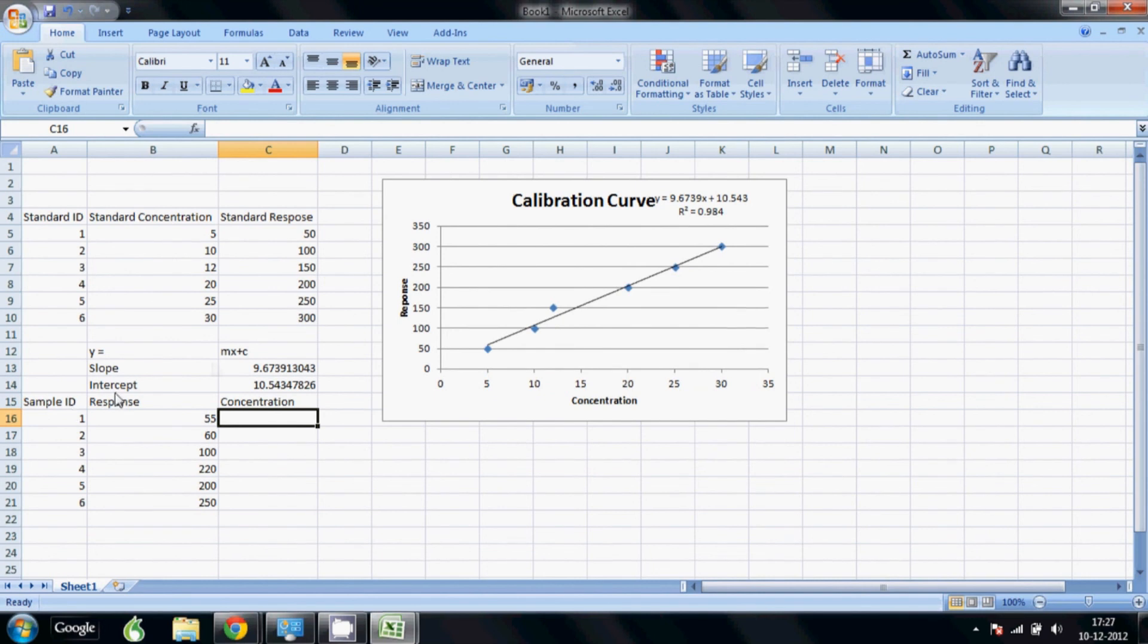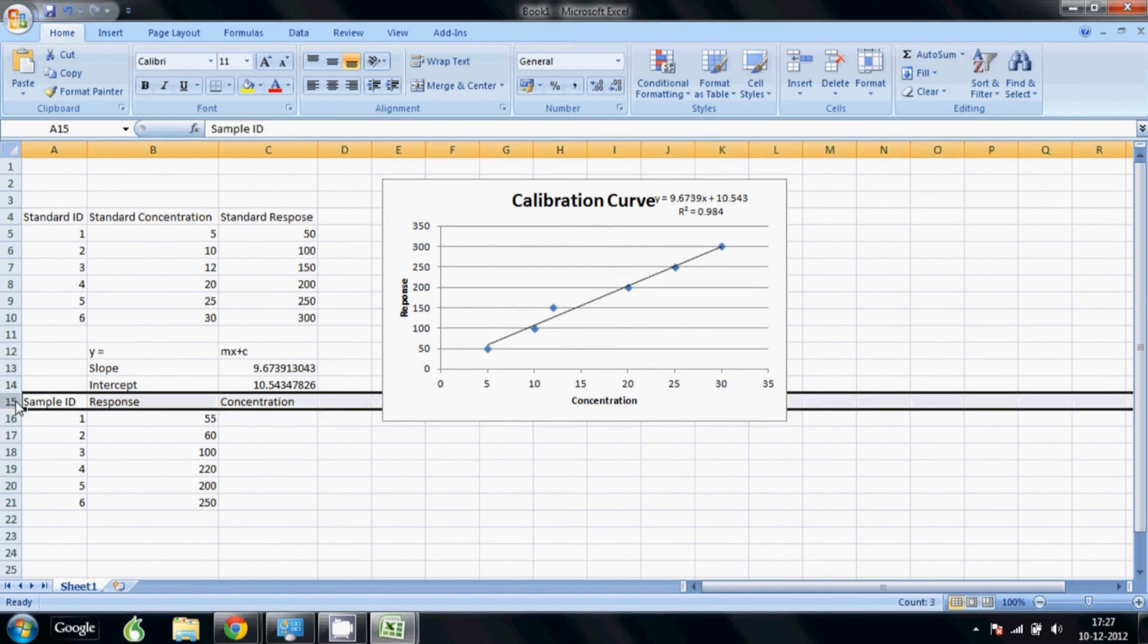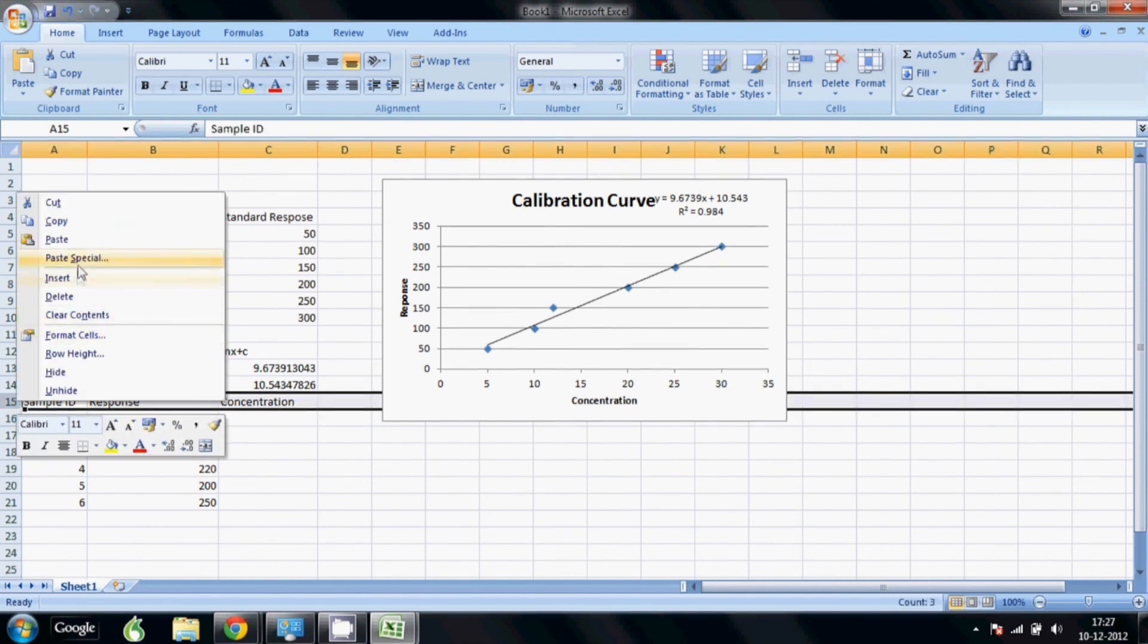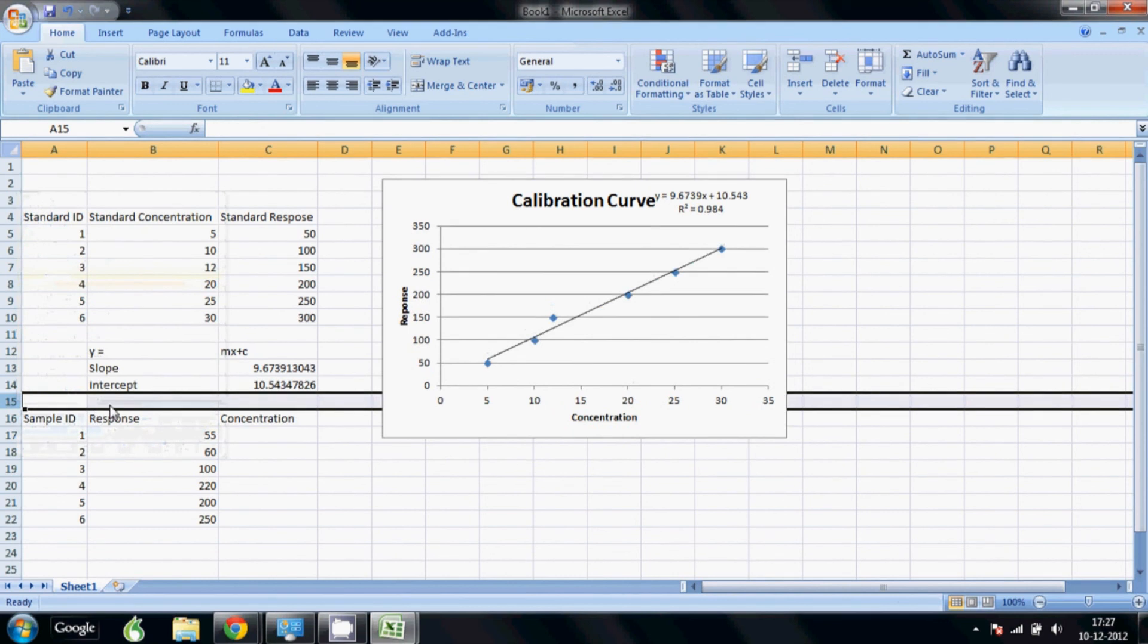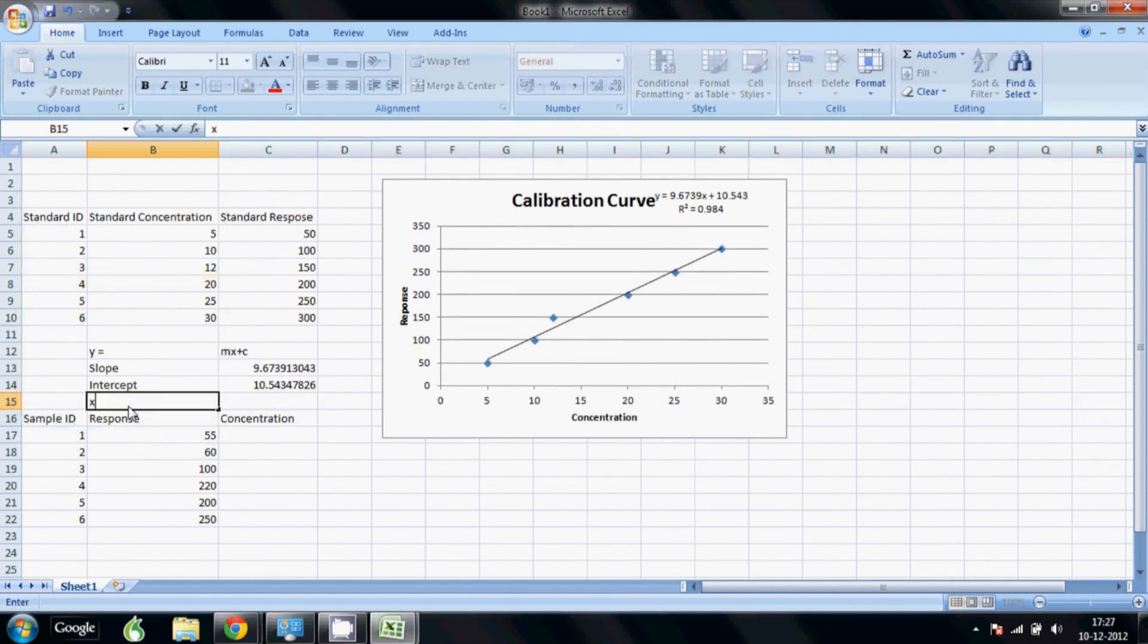So now actually we are calculating x not y. So if we just move, change this equation, I will just add a line here to show it. Insert so x actually is equals to y minus c divided by m.